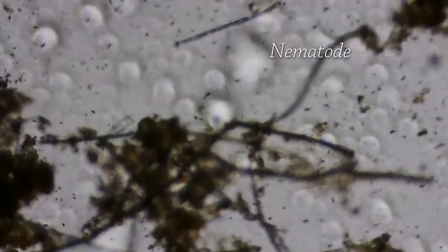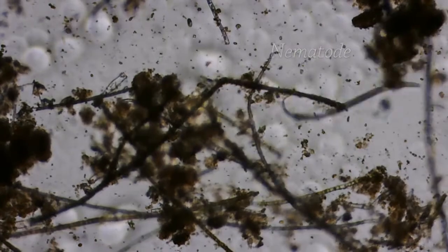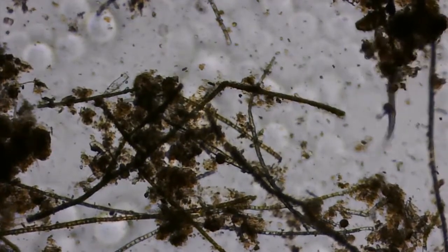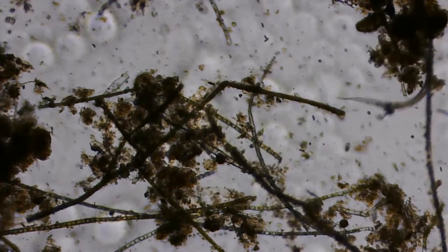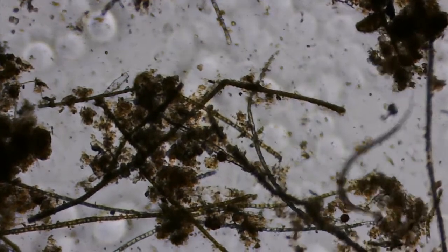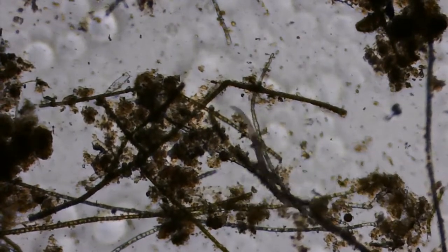There's something in front of it, which... Are we going to get a good view of it? Nope, because we're on to some new footage. And that squiggling thing there is a nematode, which is a kind of worm, although it's got its own phylum, the Nematoda. Nematos, the Greek for thread, and oidos, meaning like, for obvious reasons. And that characteristic S-shaped motion is very typical of what you'll see in a nematode. Don't ask me to identify what kind of nematode this is, because they're pretty much impossible to identify unless you're an expert, because they all look the same.